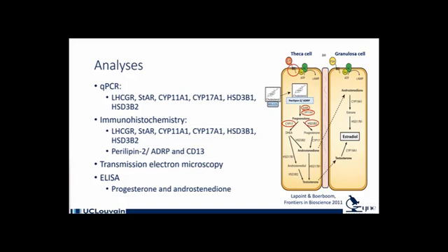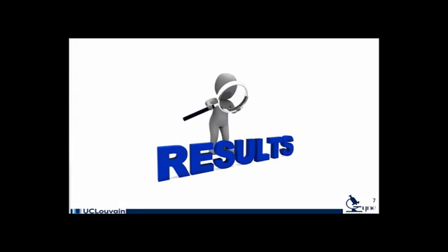We also analyzed the ultrastructure of the cells before and after in vitro culture using transmission electron microscopy. Finally, we measured progesterone and androstenedione levels in the medium at days 2, 4, 6, and 8 after the culture using ELISA kits.